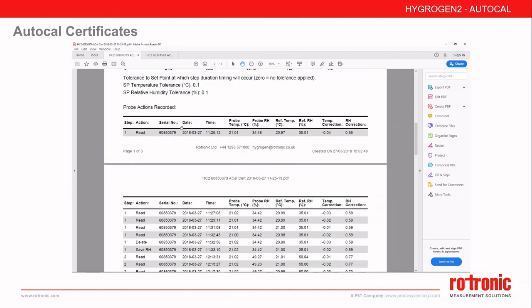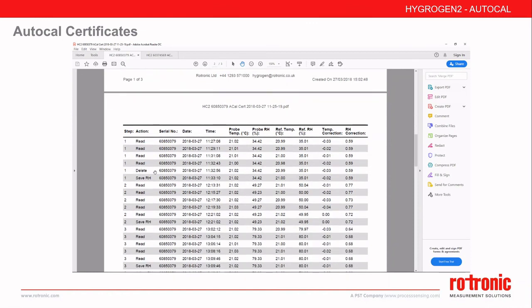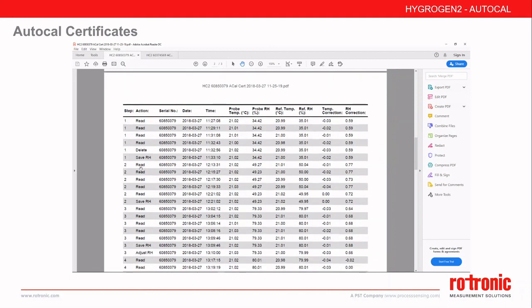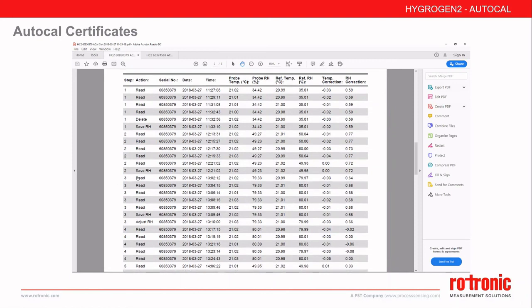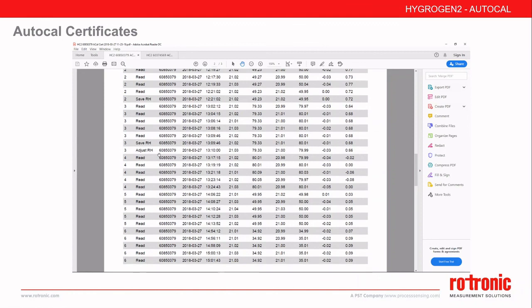In the probe actions table, we can see step one with the five readings as normal. AutoCal will then delete any saved points on the probe — this is not making any adjustment, it is just deleting any acquired points in the Hygoclip itself — and it then saves the first RH condition. We have the second step and a save RH, the third step and a save RH, and at this point the probe is adjusted. We can see that the temperature correction is very minimal, but at especially all points there is over 0.5% RH correction. Once adjusted, the points are repeated, and we can see that the humidity correction has reduced dramatically as the probe has been corrected against that reference.